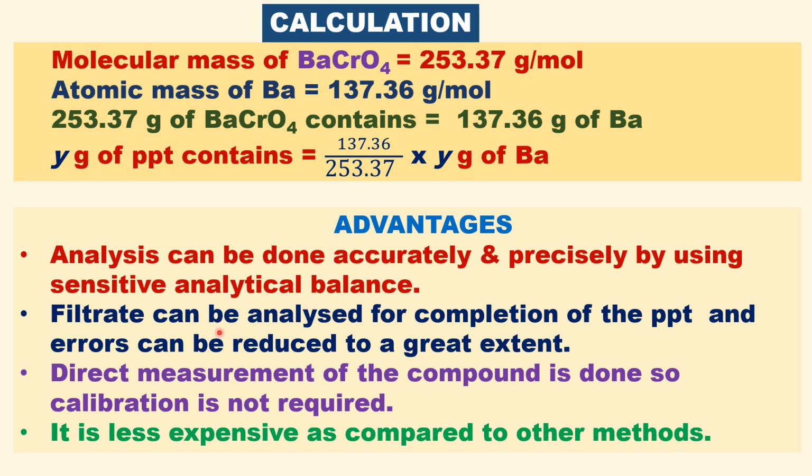Second, in the filtrate, how do you check the completion of the precipitation? If the precipitating agent concentration is low, there may be incomplete precipitation.